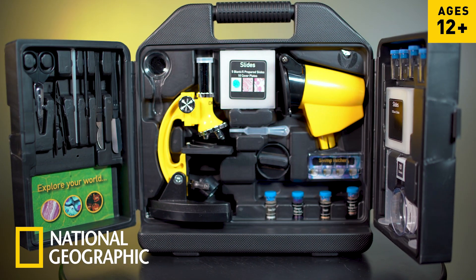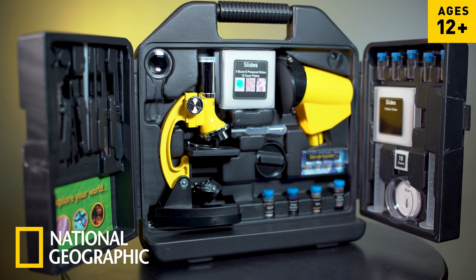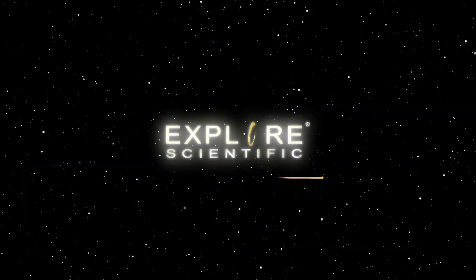Keep all of your tools organized and safe in the hard shell case for on-the-go exploration with the National Geographic 300 to 1200 times microscope.